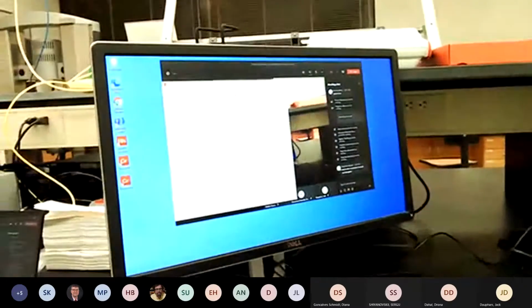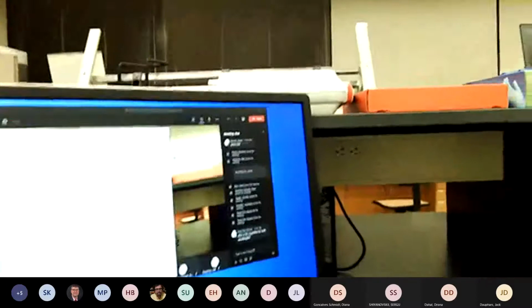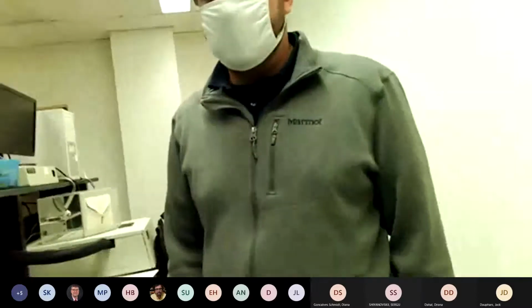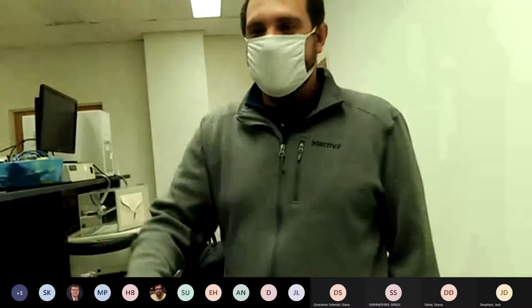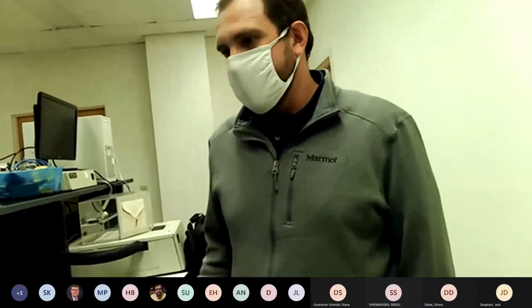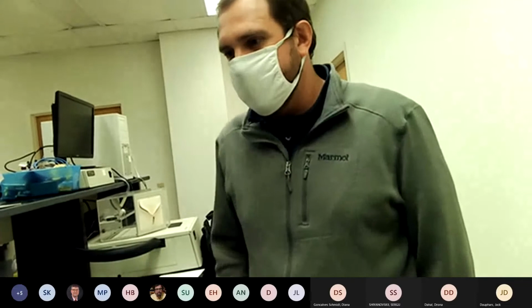Yeah. Sorry for the resolution on the screen. When you're standing over top of it, it's not even the easiest thing. This was the last thing we were working on when the time got here. But we'll get it hooked up on this nice big monitor. You can use a mouse. You don't have to use the stylus. Run everything straight from this computer. Control the instrument, and it should be much easier. It's not impossible to use here though.